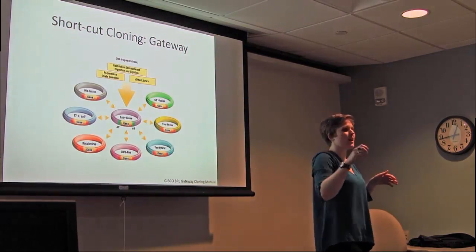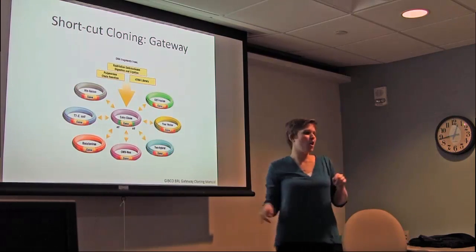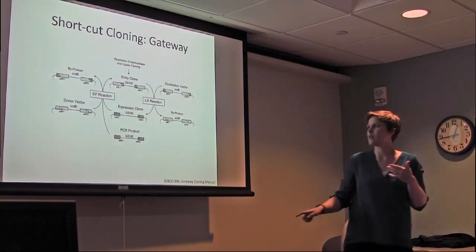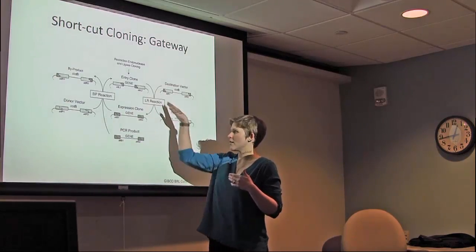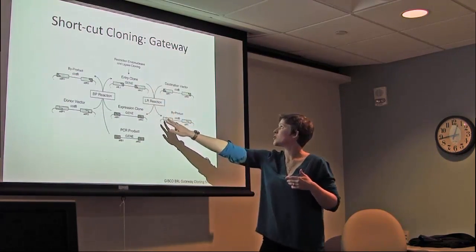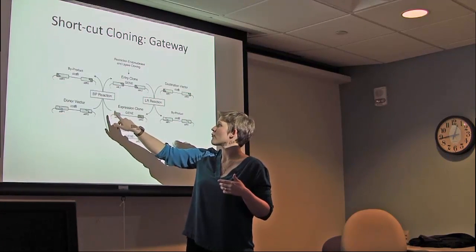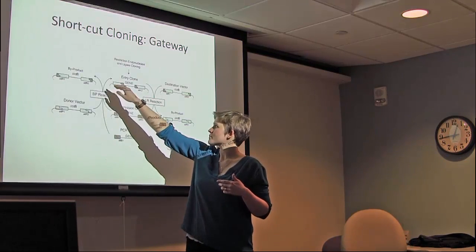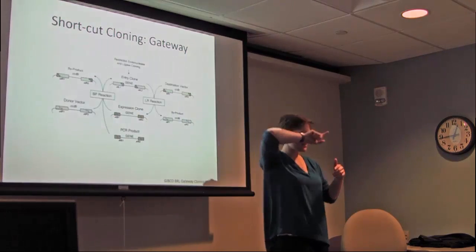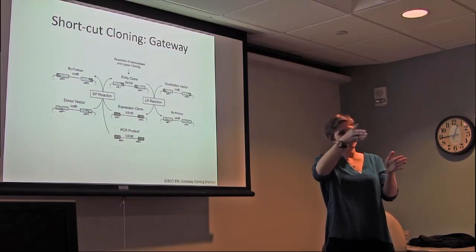So it's a really nice kind of Lego block system, where once you have your gene of interest, all you have to do is do a simple reaction, and that's explained a little bit more here, either a BP or an LR reaction. It's going to move your entry clone into your destination vector, or move it back from a donor vector into the entry clone. So you've got these different reactions you can perform to move your gene of interest into and out of different gateway systems.